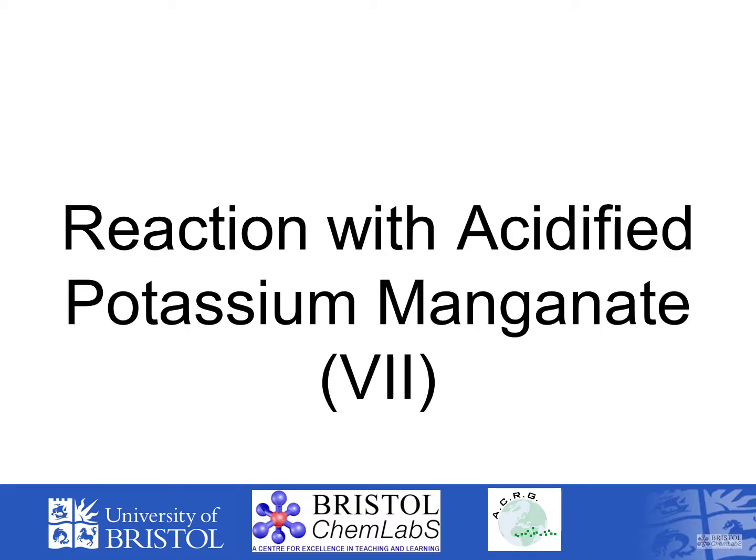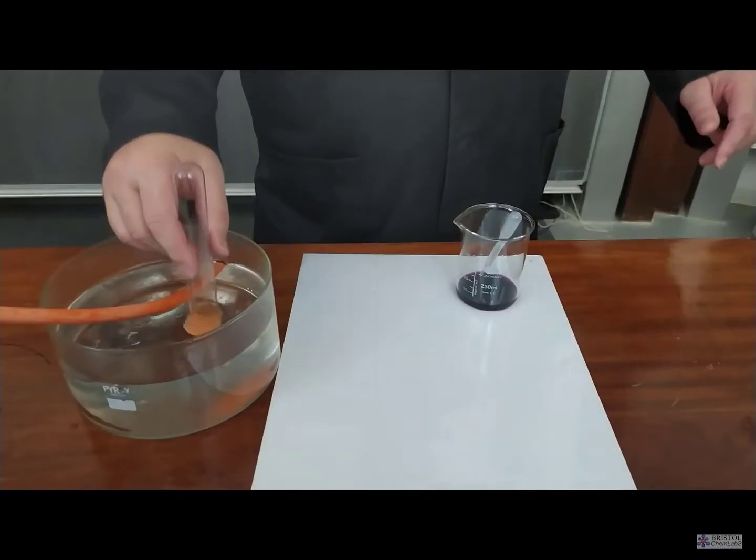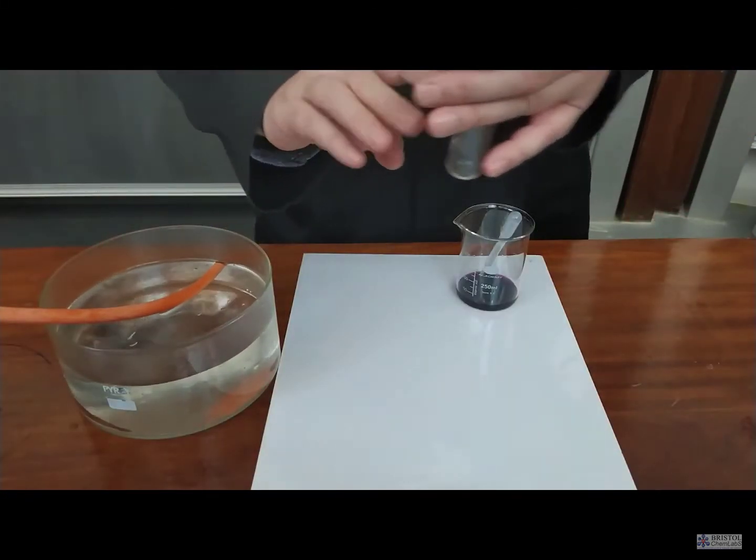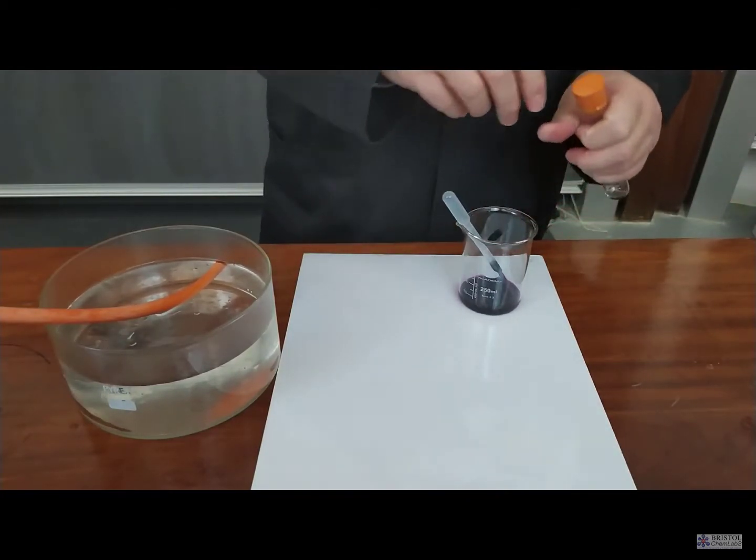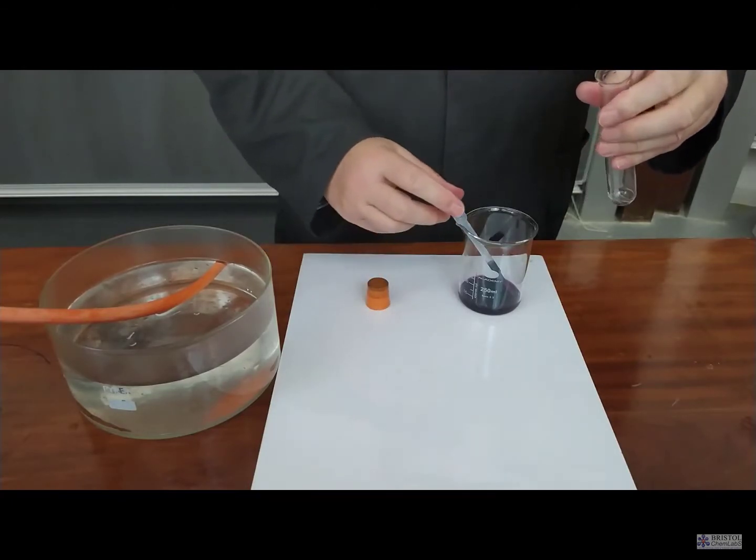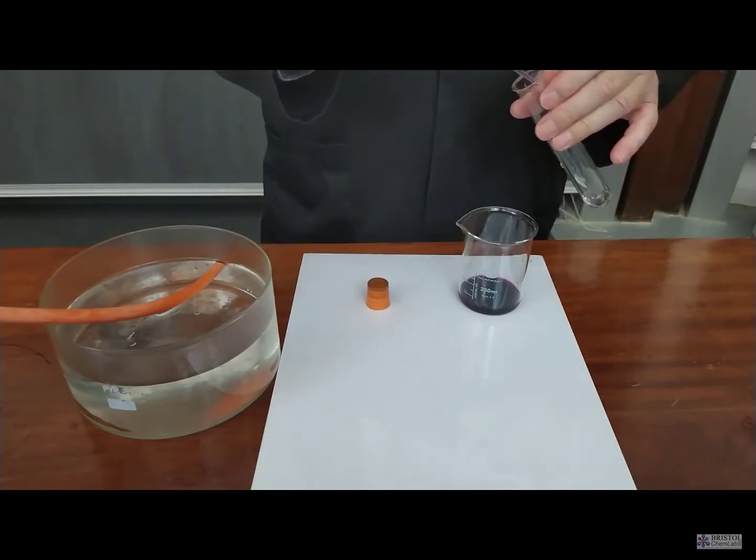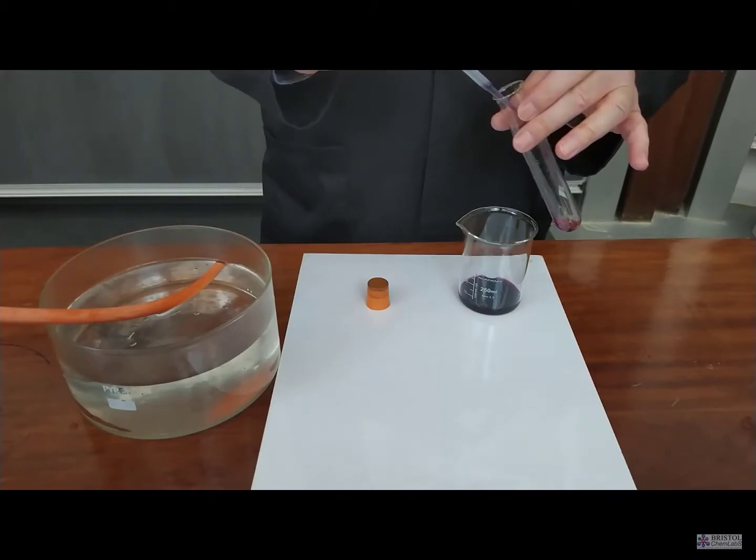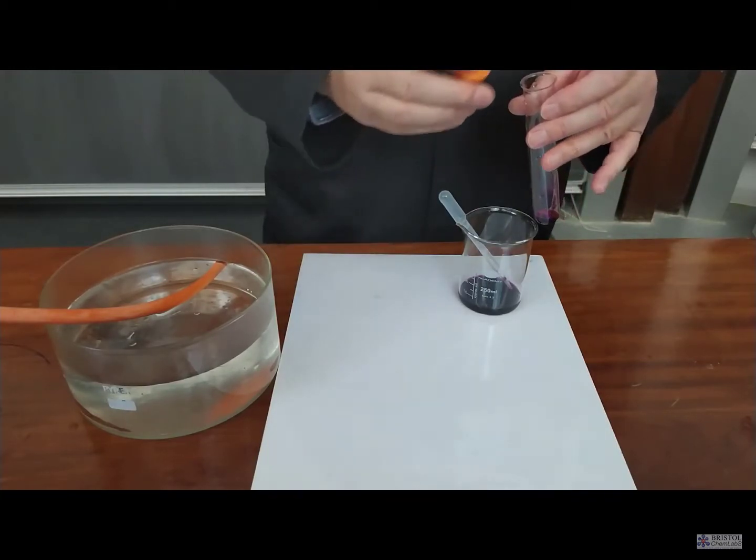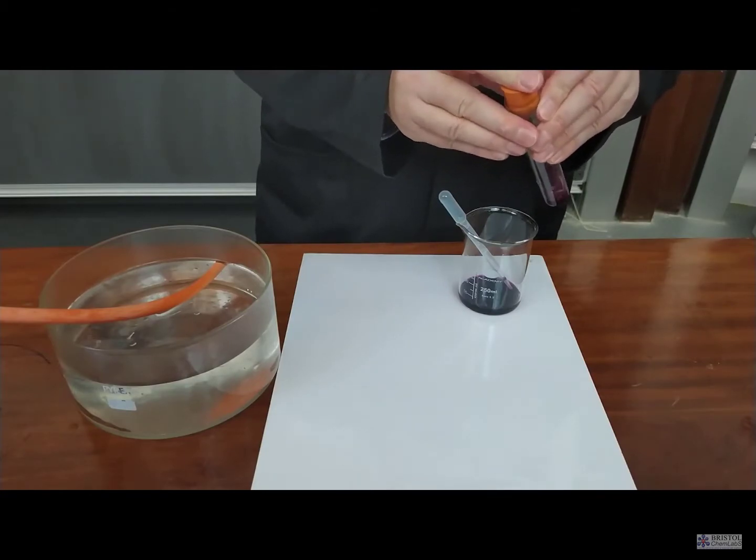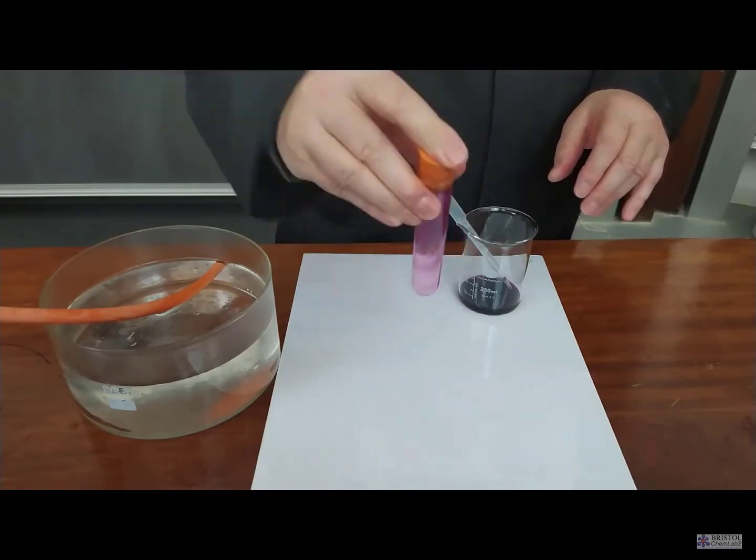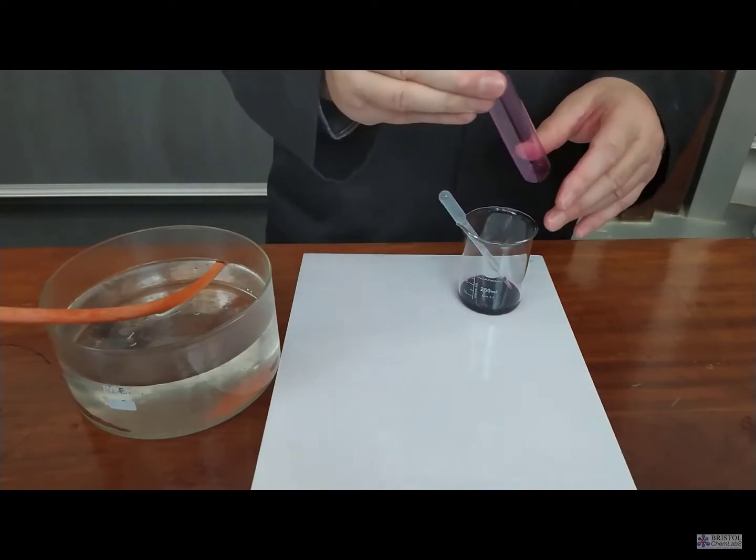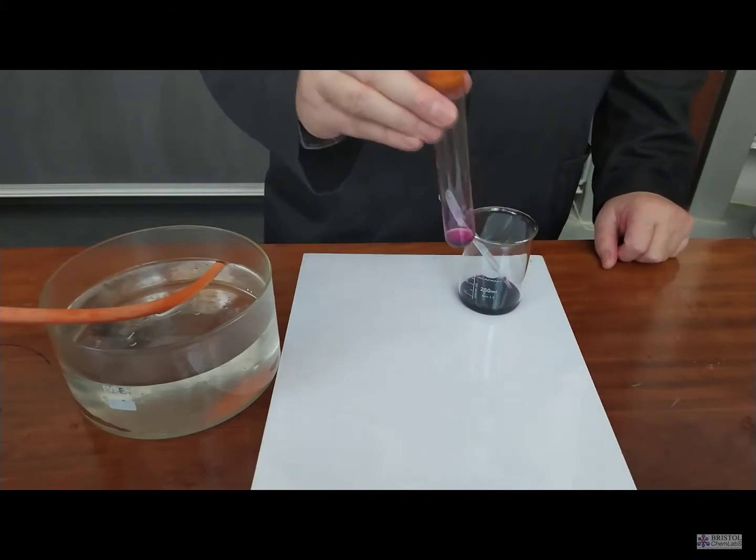In the case of potassium permanganate VII, the solution is first acidified with dilute sulfuric acid, not hydrochloric acid, because that would produce chlorine gas. What we've done here is deliberately add a too-concentrated solution of potassium manganate VII and too large a volume to show you that the color change will not go from purple to colorless—it will actually fade the color of the purple, showing a reaction has taken place. But we've done this to show a typical error that somebody might do in not reading instructions correctly.